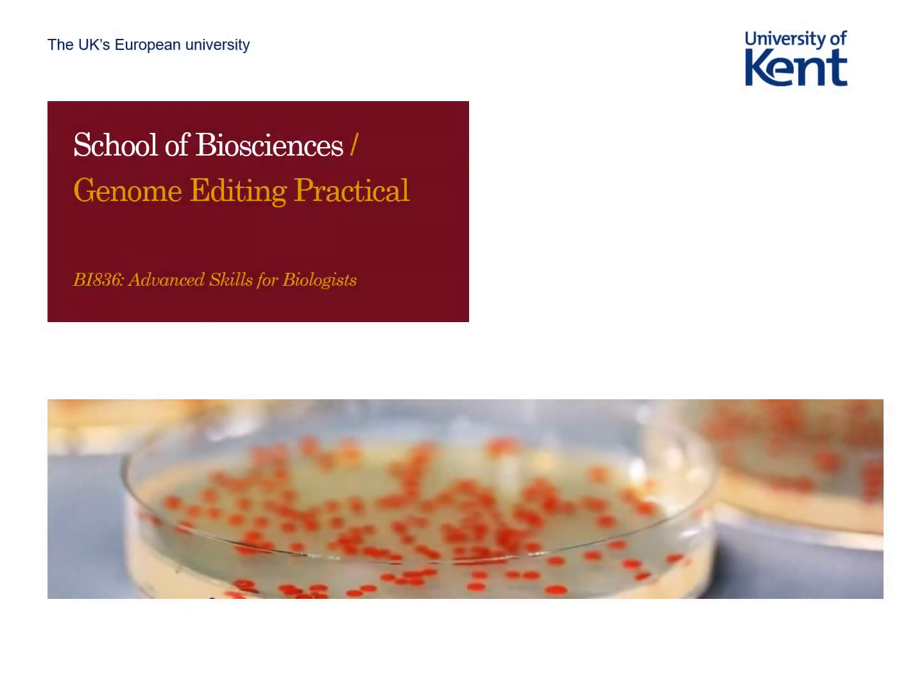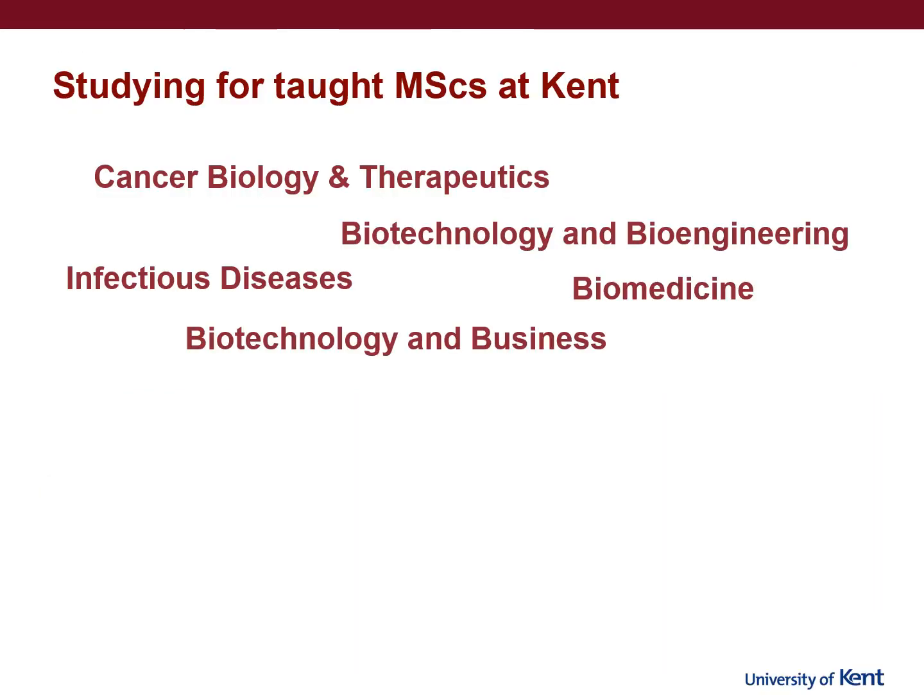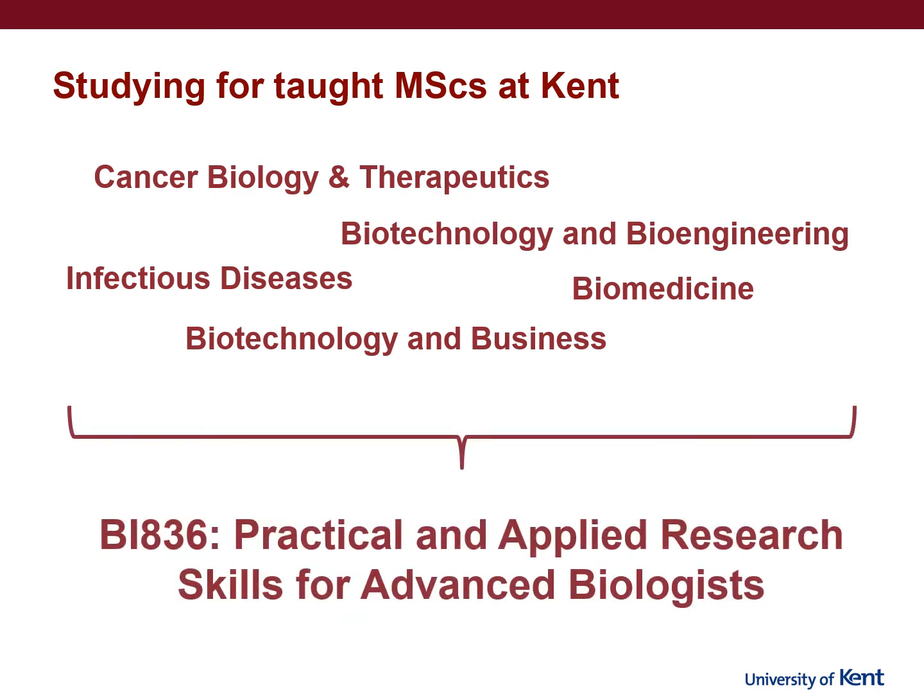This video covers the Genome Editing Practical, one of the advanced training opportunities for students on our taught master's degrees. A central element of our taught MSc programs is the provision of training in cutting-edge research skills. Much of this is delivered in an autumn term module on practical and applied research skills for advanced biologists, which all students on the experimental MSc degrees take together. This module delivers research skills through seminars, online content, and practical work.